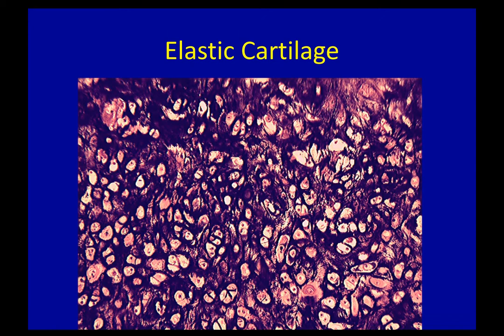Now, with elastic cartilage, what kind of tissue is it? I know you're getting sick of me asking you, but it's a way to remind you: you need to know that. Connective tissue. Identify the slide. Well, it's elastic cartilage. Where would you find elastic cartilage? The ear.